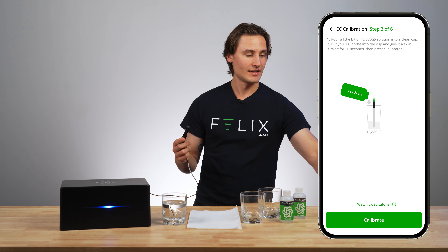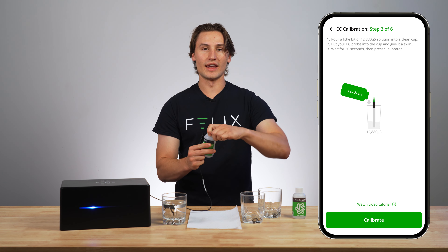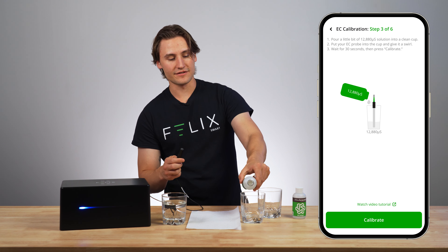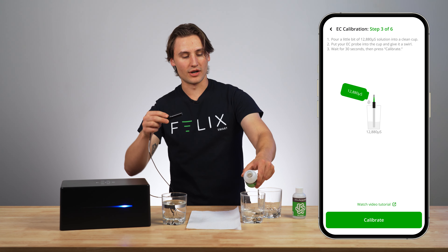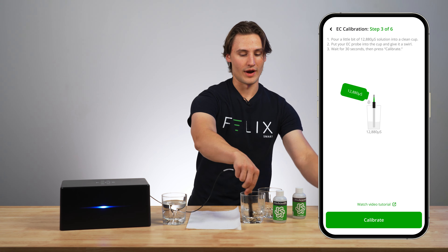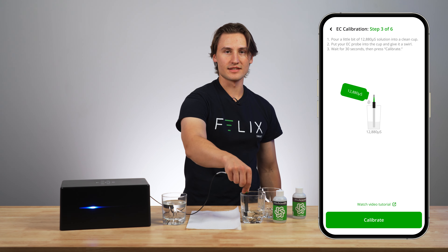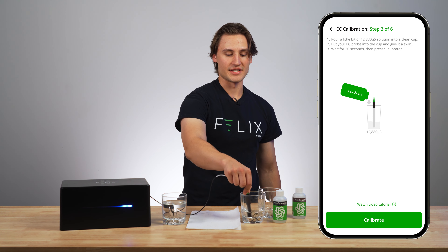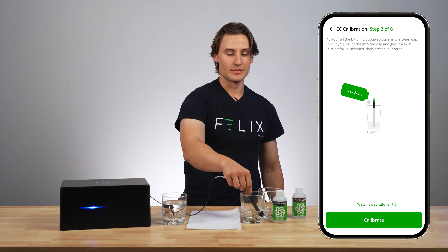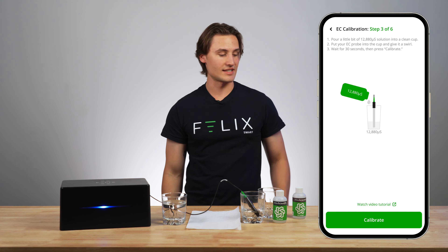Now I can move on to the next step. It says pour a little bit of my 12,880 solution into a clean glass, so that's exactly what I'm going to do. I'm going to pour enough solution to make sure that the hole in my conductivity probe is completely covered. Now I'll put my EC probe into the cup and give it a swirl around — really swirl this for maybe 15 seconds — and then I'll wait patiently before pressing calibrate. It's really important that you wait the specified amount of time in the app. Here on this step it's 30 seconds before pressing calibrate. So I leave my probe there, I can see that the liquid covers the hole, and I'll press calibrate.